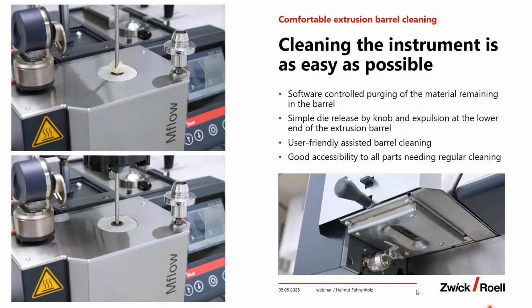The hardest is cleaning the barrel, and here we can use the piston movement, so the weight lift, to do an up and down movement in order to shoot little cotton cloths through the barrel for cleaning, so that makes it easier for the operator. So there is a cleaning function for that.